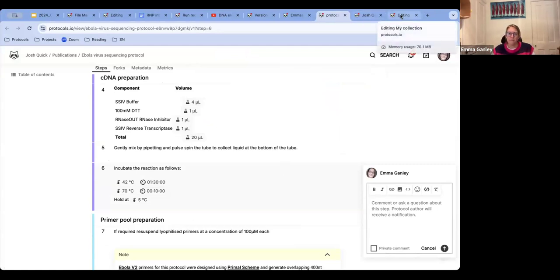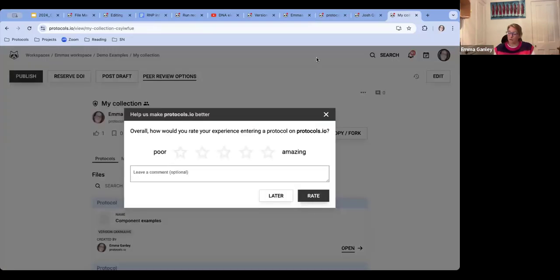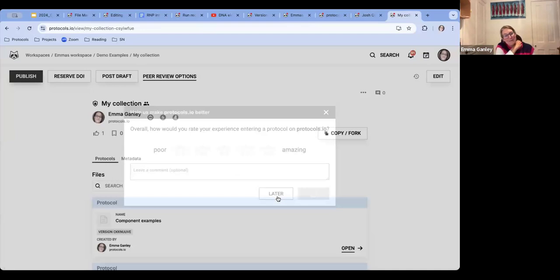The next thing I was going to talk about quickly was collections. If you are using protocols.io, it really wants me to rate the platform today. It keeps asking me every time.